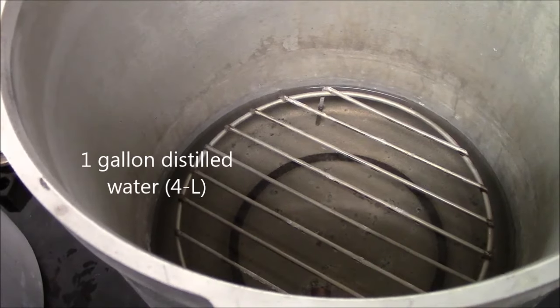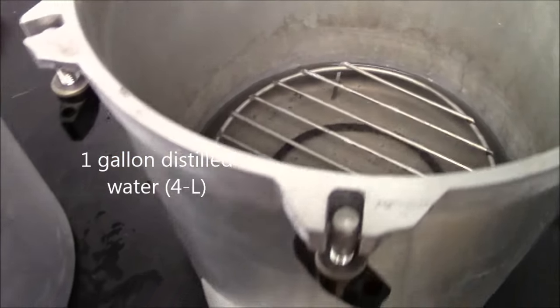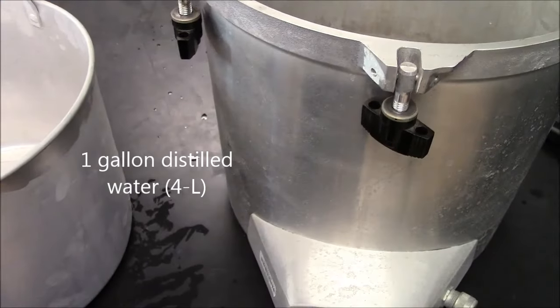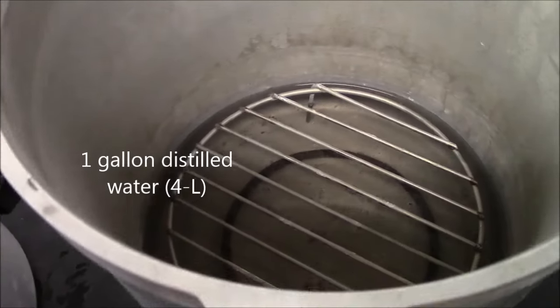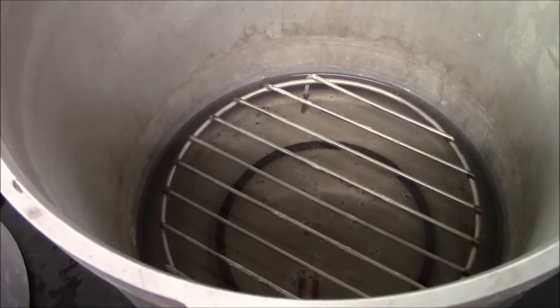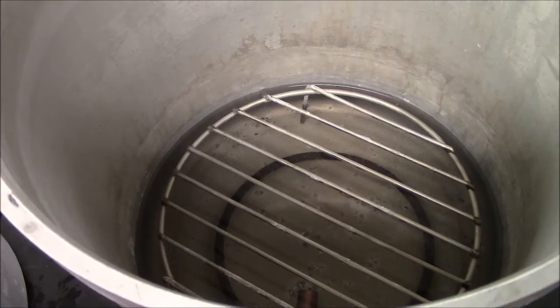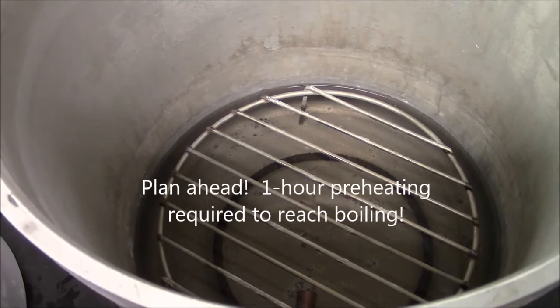I put a gallon of distilled water in the bottom of the pressure cooker. It takes about an hour for it to heat up to boiling temperature so you must plan ahead when you're doing this.